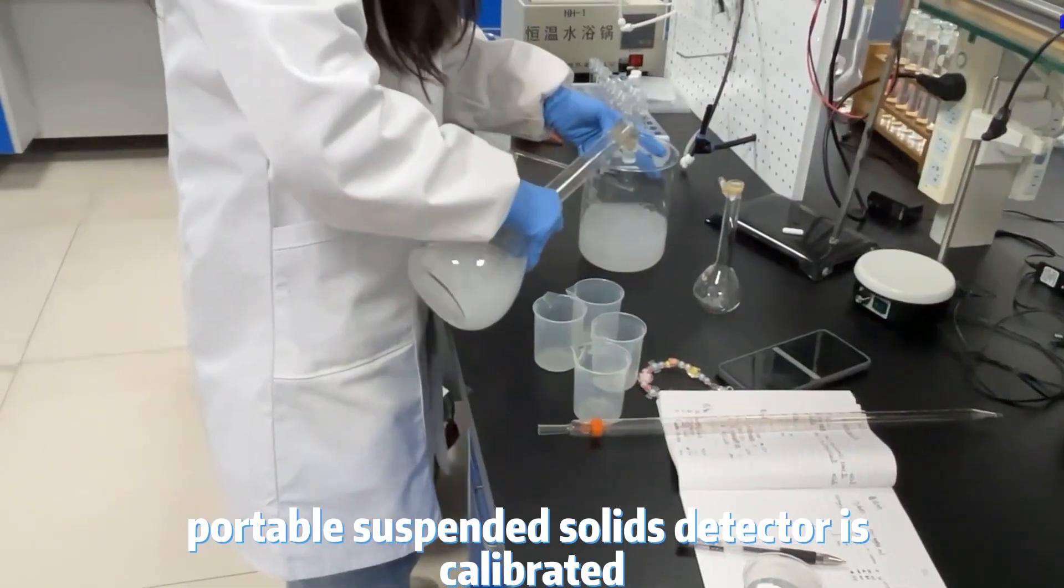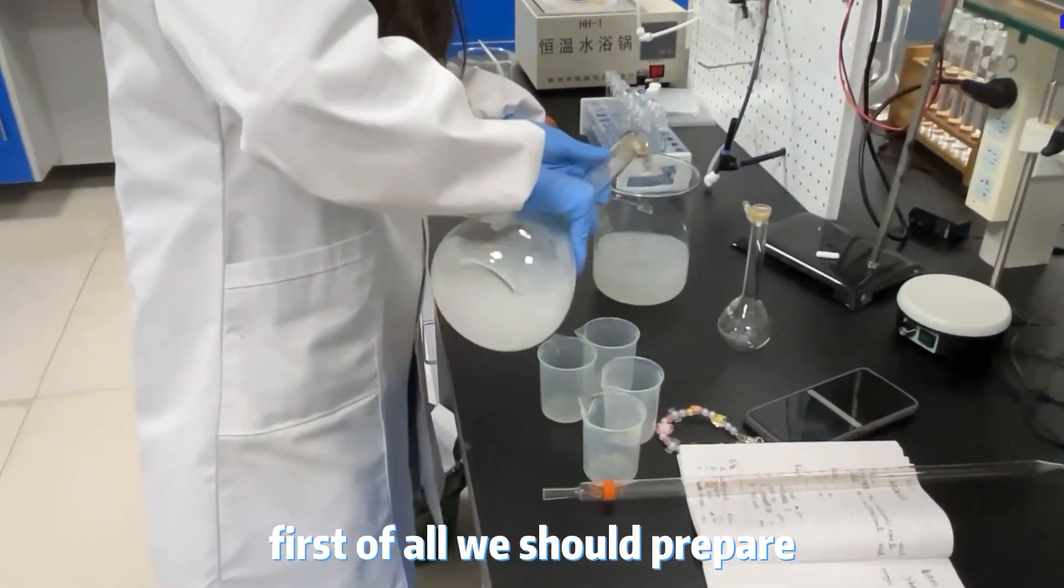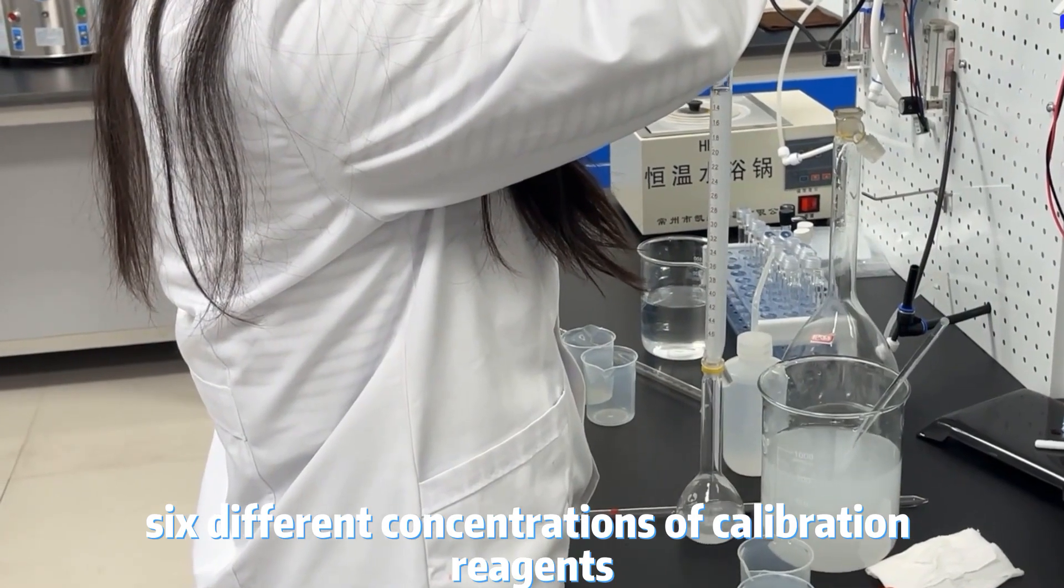Come with us today to see how the portable suspended solids detector is calibrated. First of all, we should prepare six different concentrations of calibration reagents.